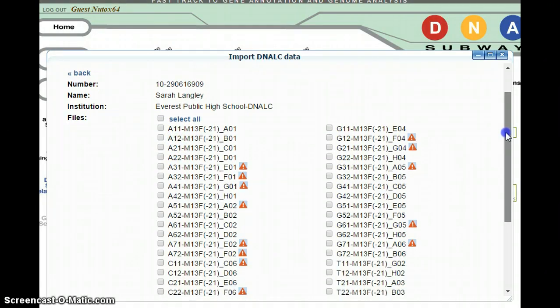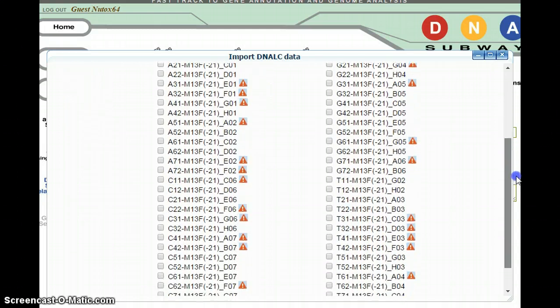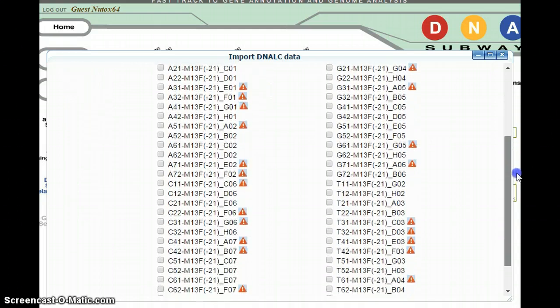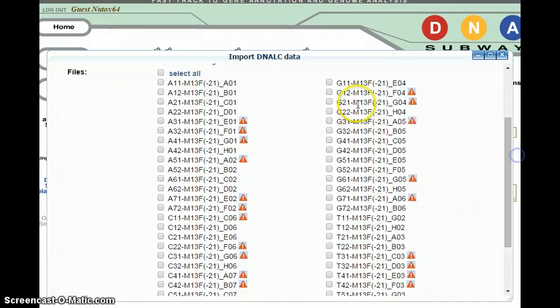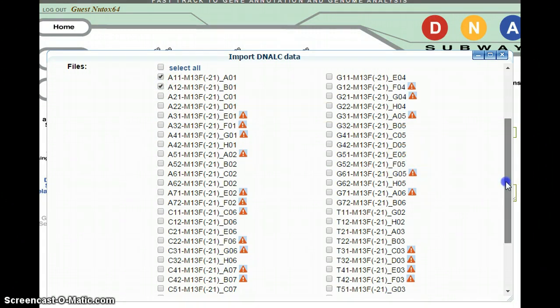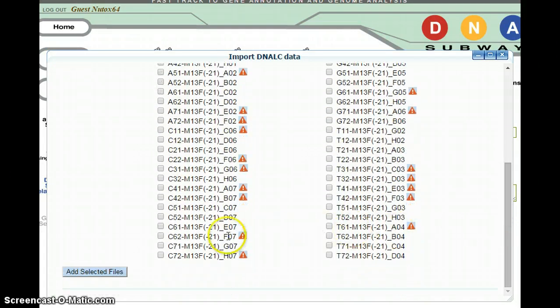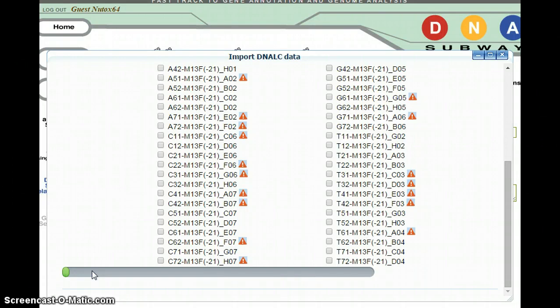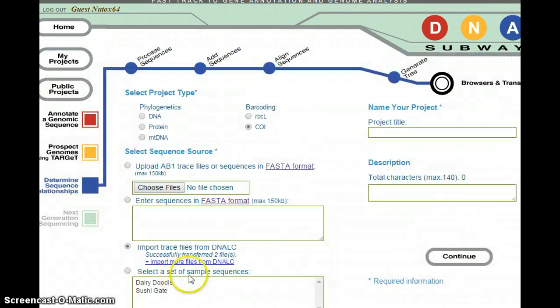Go ahead and find your two samples. For example, let's say that I am Section A, Team 1, with my two samples. I'll go ahead and click next to my two samples. I'll scroll down and hit the button that says 'Add Selected Files.' It may take some time to upload, as you can see with the green bar.